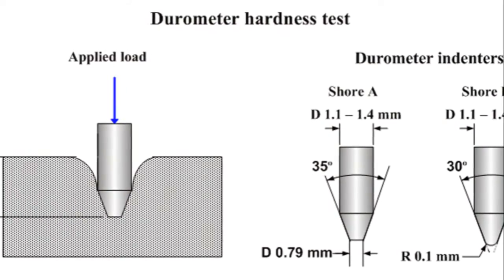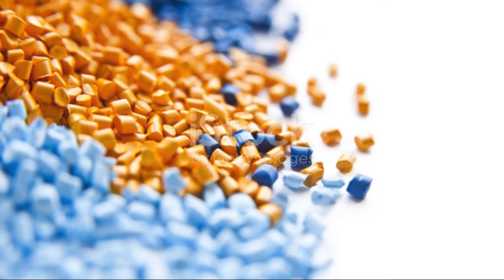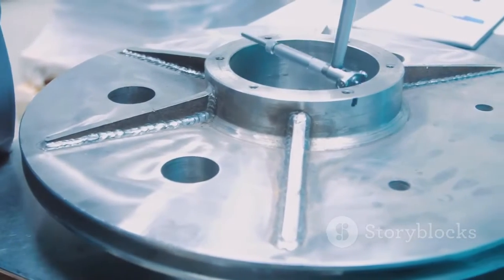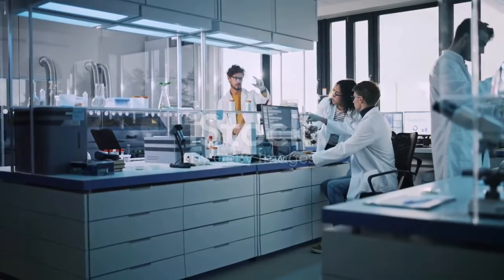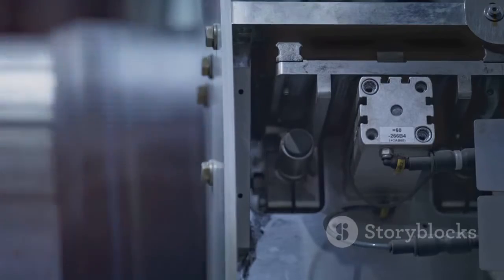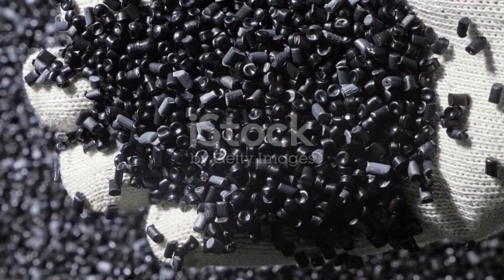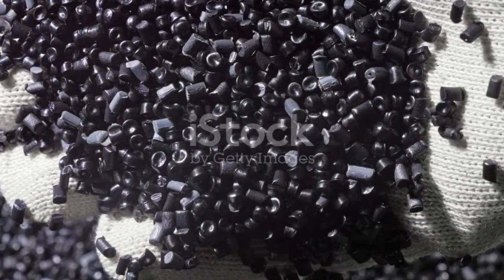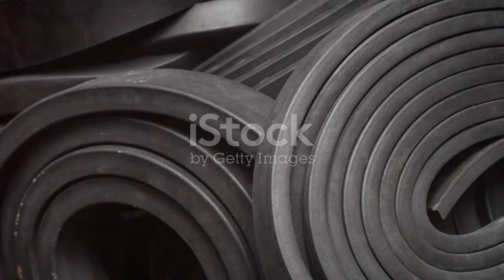It covers 12 types of rubber hardness measurement devices known as durometers, types A, B, C, D, DO, E, M, O, OO, OOS, and R. It's used for determining indentation hardness of substances classified as thermoplastic elastomers, vulcanized thermoset rubber, elastomeric materials, cellular materials, gel-like materials, and some plastics. However, it's not applicable to the testing of coated fabrics.